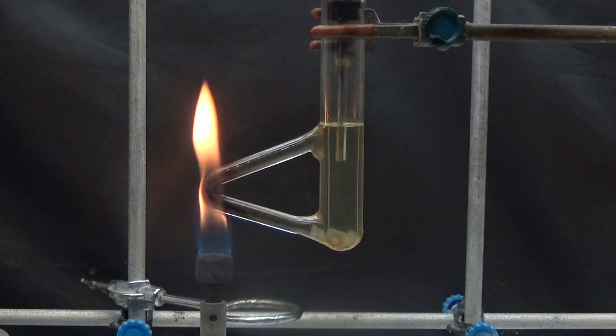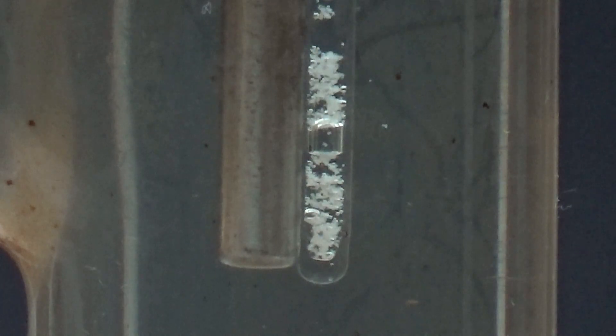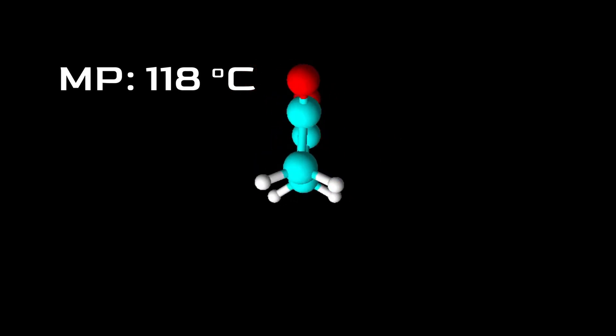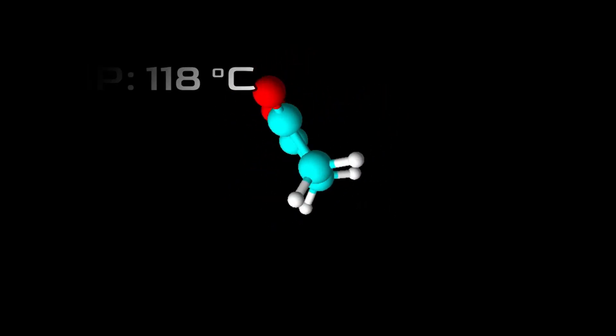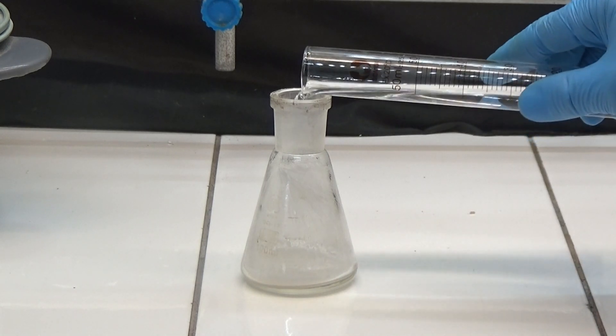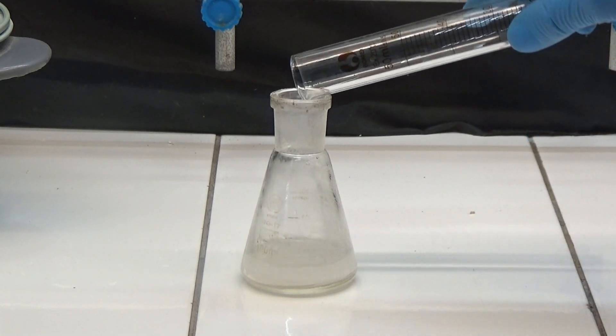The melting point test showed a result between 130 and 140 degrees. The melting point of succinic anhydride is 118 degrees. A mixture of anhydride and succinic acid is the reason for the low melting point and unmelted white material in the capillary.